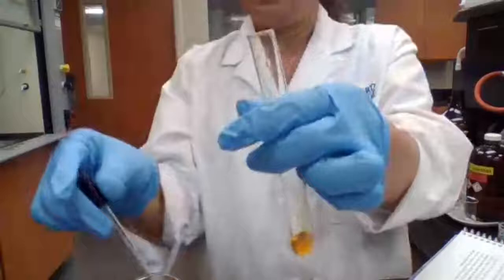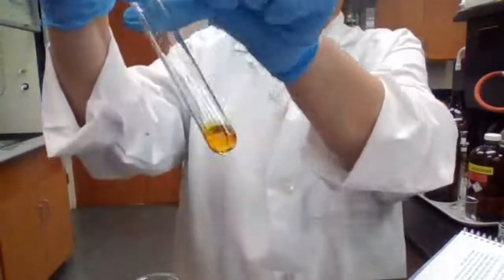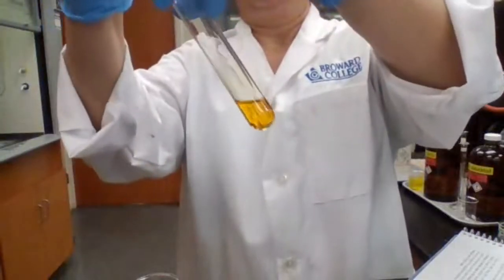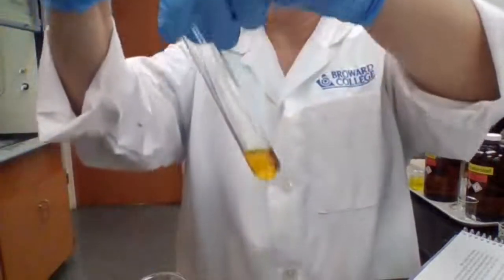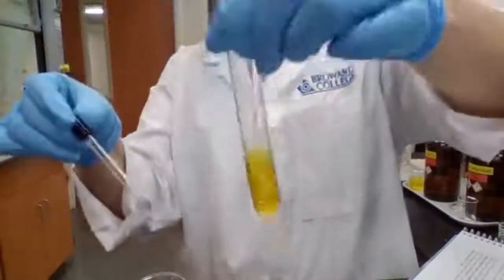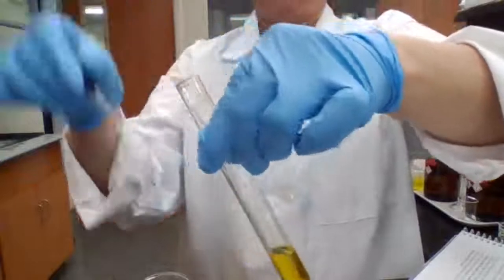Because the concentration of H2SO4 was 3 molar and this is 1 molar, it might take a longer time, but eventually you will see the color change again.